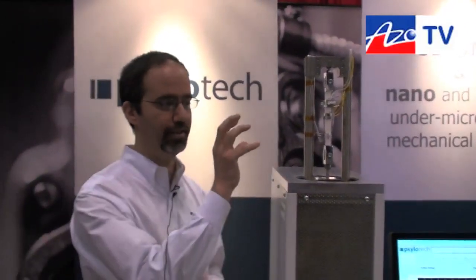As far as the heating of the chamber, we also have forced air. So instead of just having a heater, we have a fan that circulates air and gets the sample to temperature faster, making the test take less time.